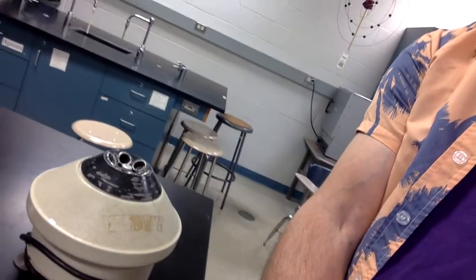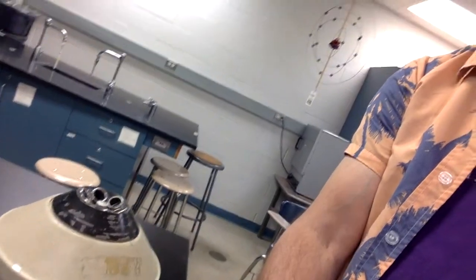Okay, I'm ready for the second video of the carbs portion. You can see here that our centrifuge has stopped spinning. So we have that spinning for 5 minutes. Let me show you what the centrifuge has accomplished for us. Of course, that's just the water test tube.